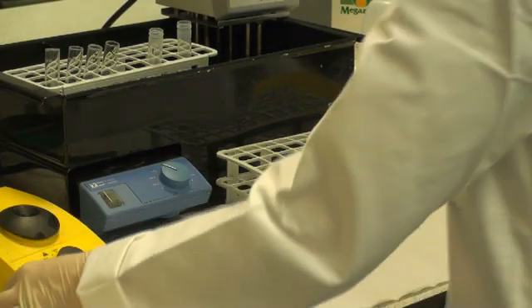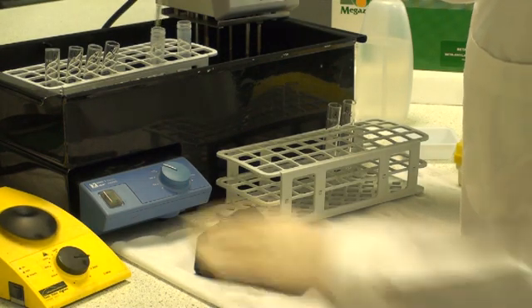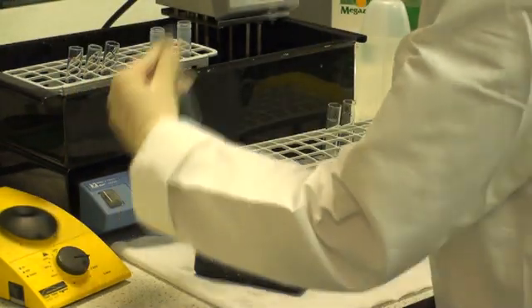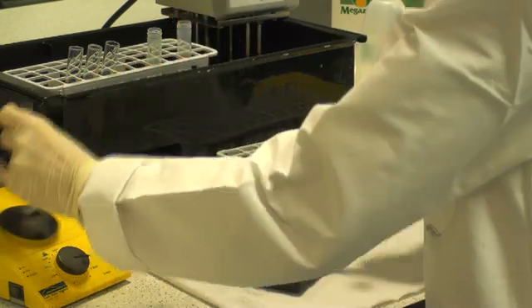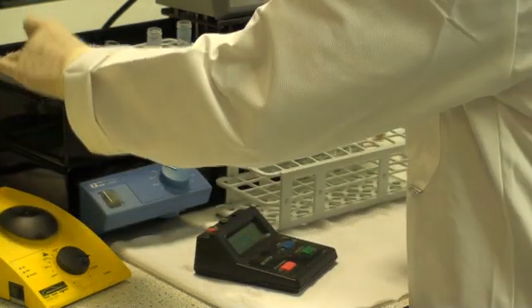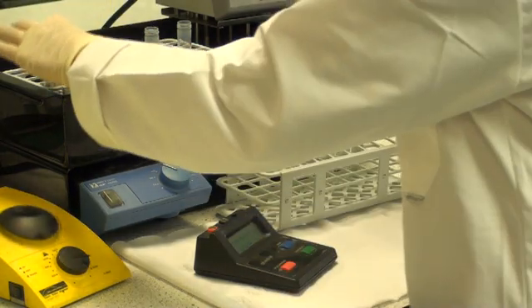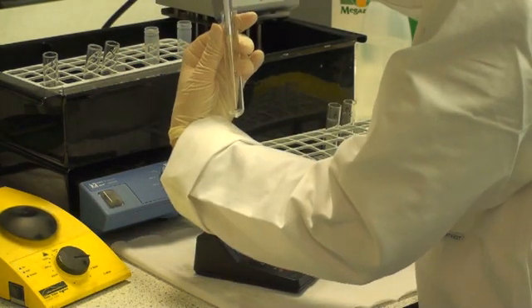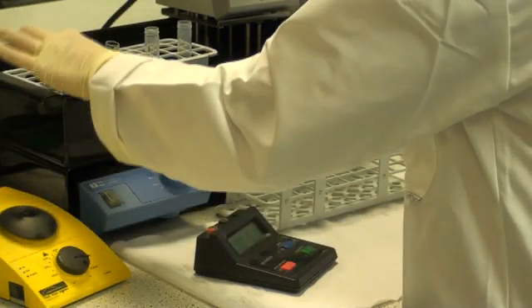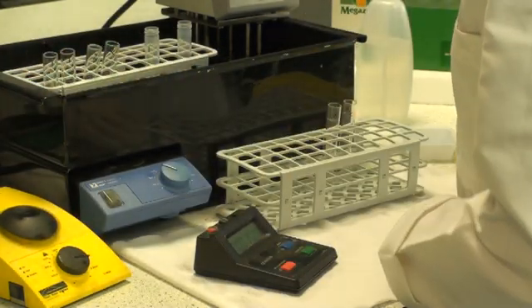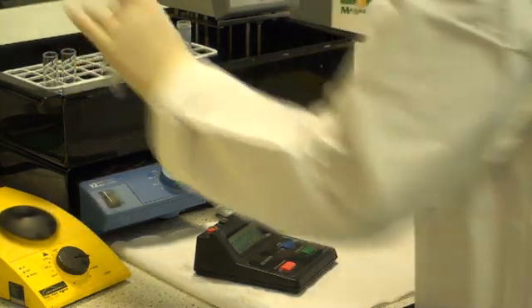Initiate the reaction by adding 0.2ml of diluted malt or barley extract to the substrate solution pre-equilibrated. Be careful to add this to the bottom of the test tube so that all of the enzyme preparation comes in contact with the substrate. Each sample is assayed in duplicate, and these reactions are allowed to proceed for exactly 10 minutes before the termination of the reaction.